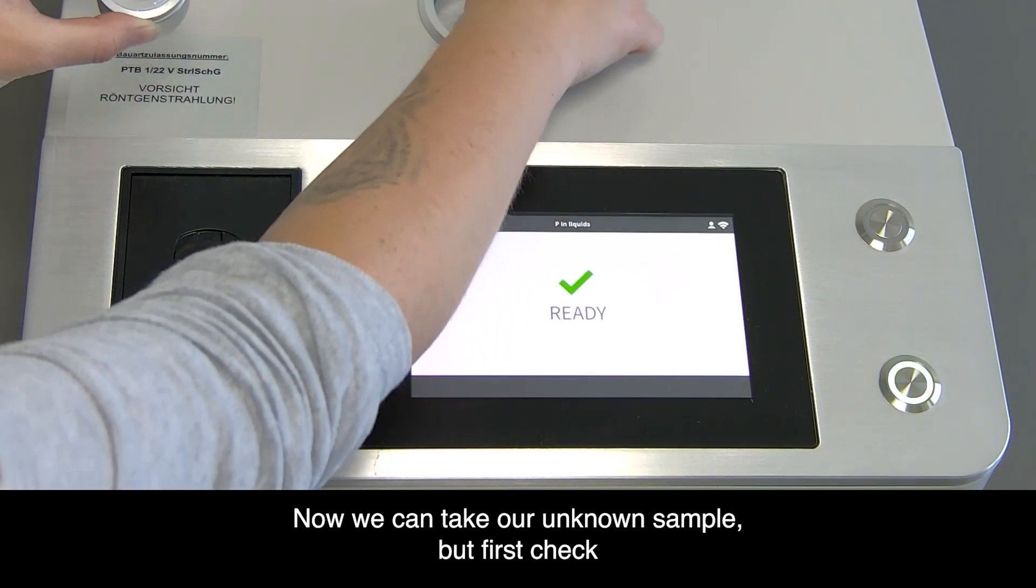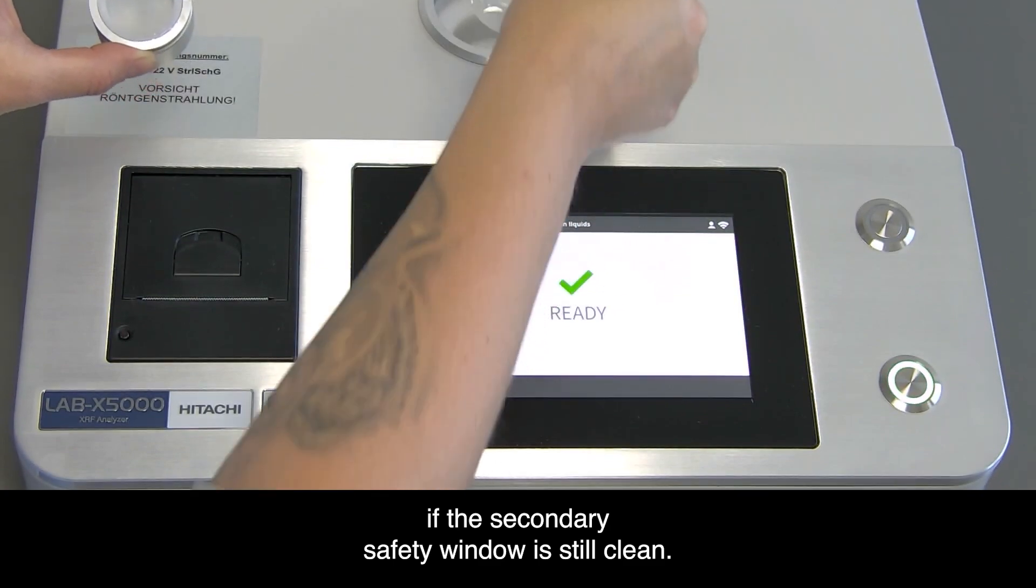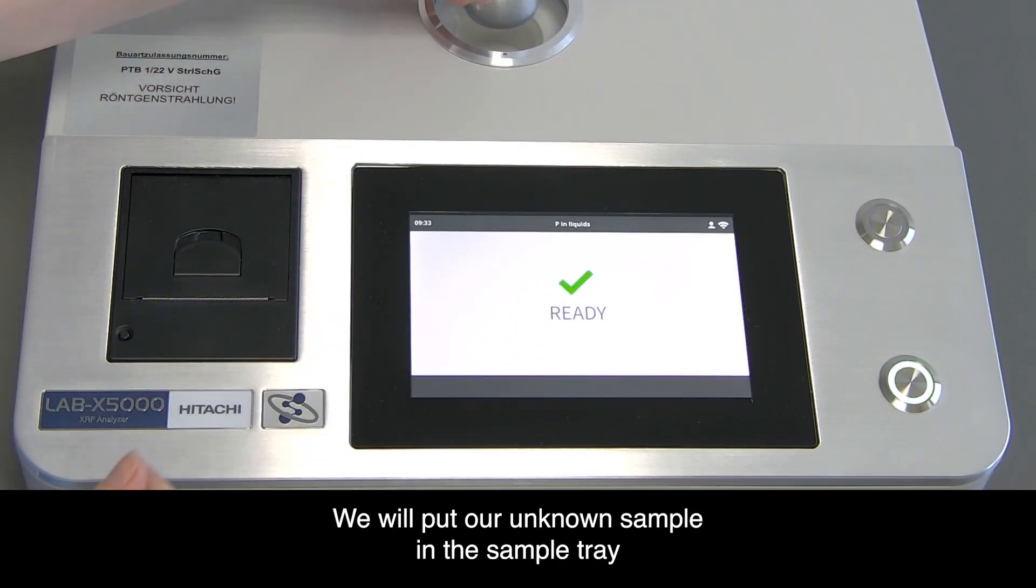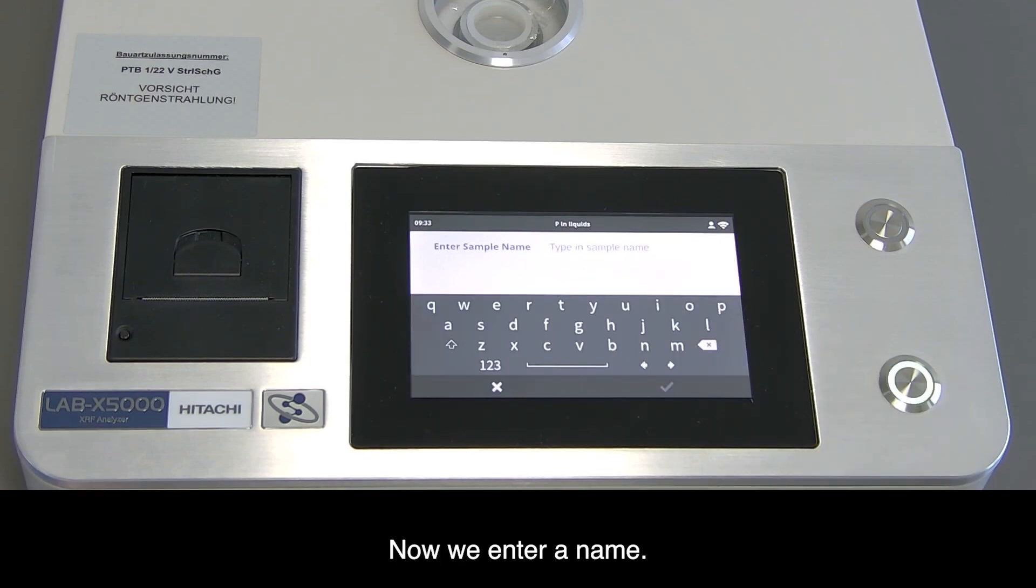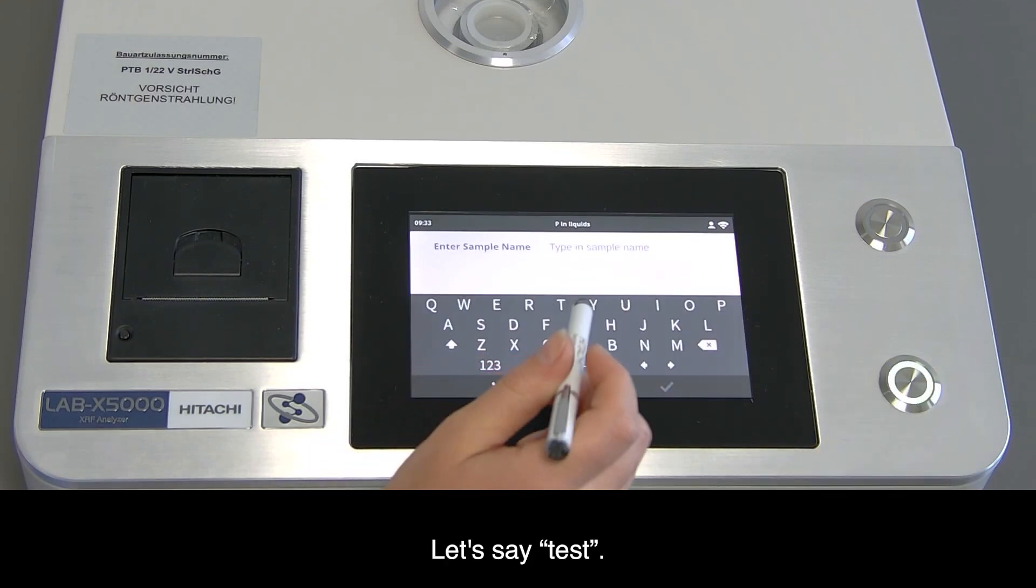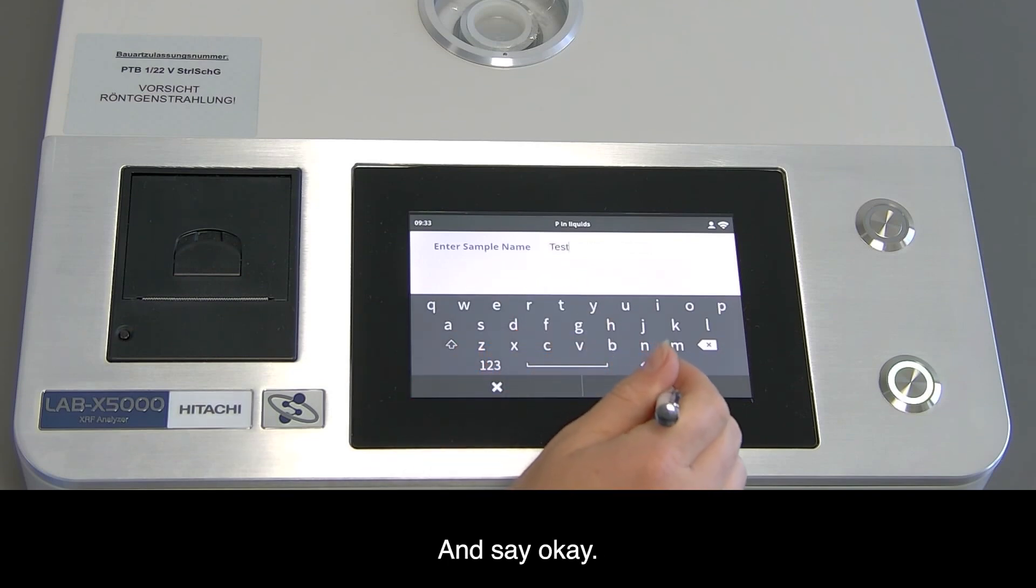First check if the secondary safety window is still clean. We'll put our unknown sample in the sample tray and press the start button. Now we enter our name - let's say 'test' - and say okay.